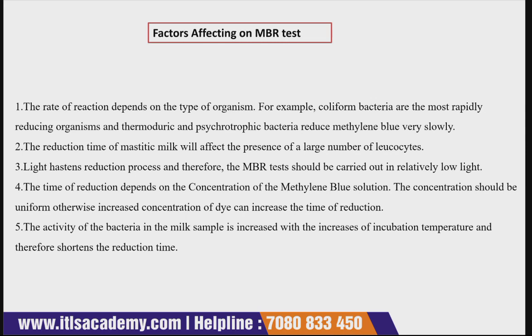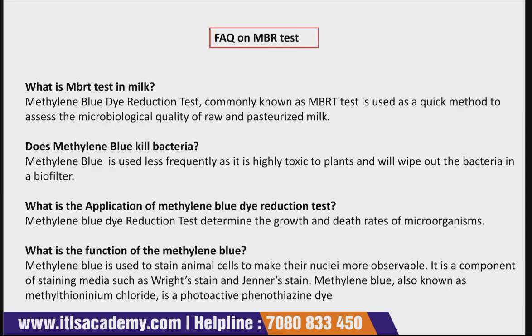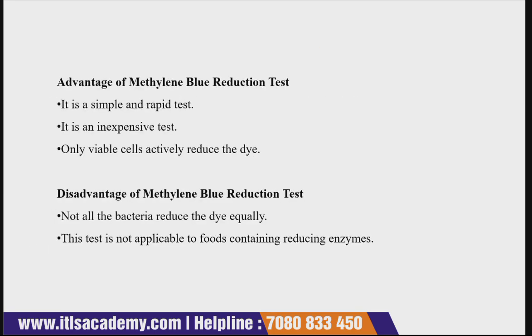The last factor is the activity of bacteria in the milk sample. The activity of bacteria in the milk sample increases with the increase in incubation temperature, and therefore shortens the reduction time. So these are the factors that affect the MBR test.